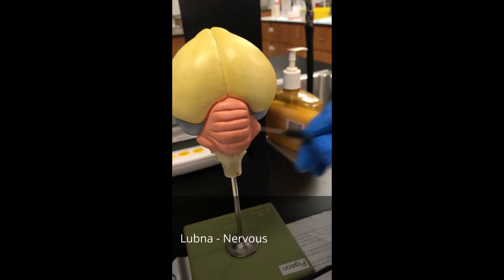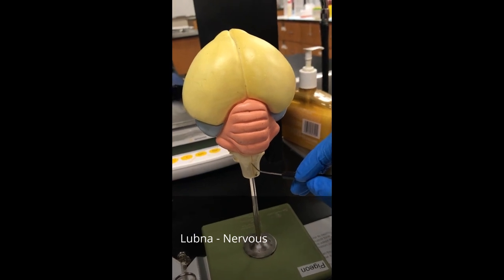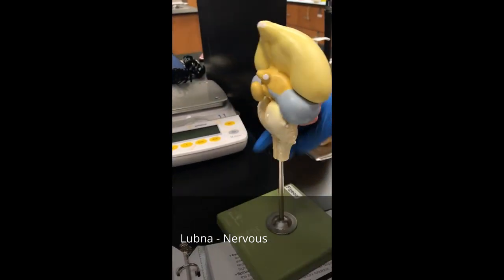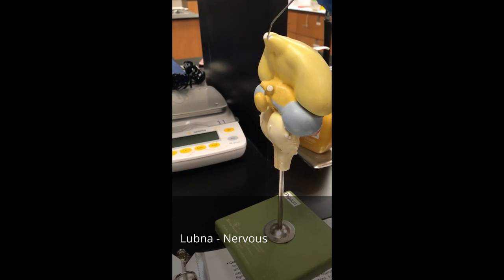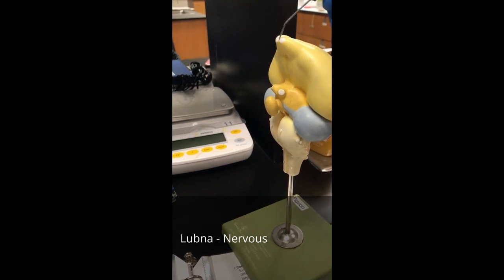So here we have the two optic lobes, and these are for sight. And this is the medulla, and it's the brain stem, and the neurons here help control heart rate, respiration, and blood pressure. And then here we have the olfactory lobes, and these are where the nasal connects to here, so it gets the sense of smell up here.